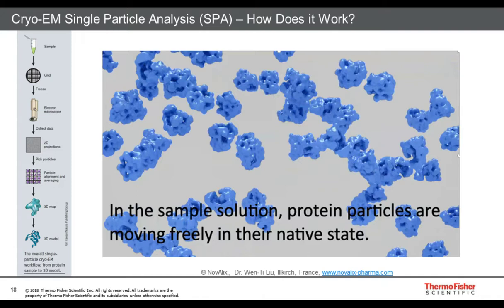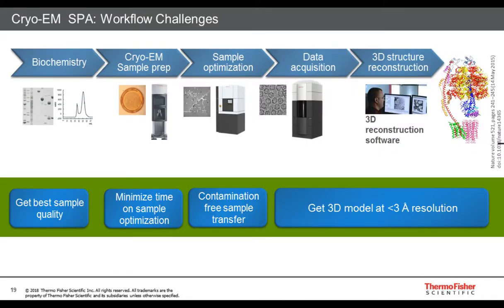But suppose you get to the right stage, to the right concentration, then the next phase is to do the vitrification. And the vitrification is something that has been automated. In the last 10-15 years, various vitrification devices have been developed. One of them is the Vitrobot, and there are a few more, which remove the critical parameters that determine the variations of the right ice quality. You would like to get repetitive ice quality every time you do the vitrification step.